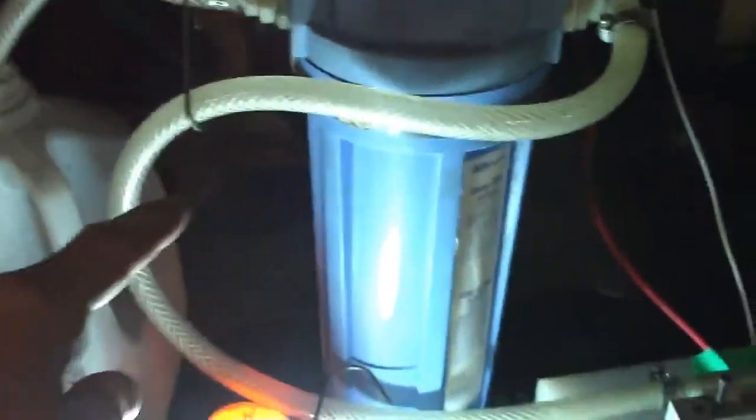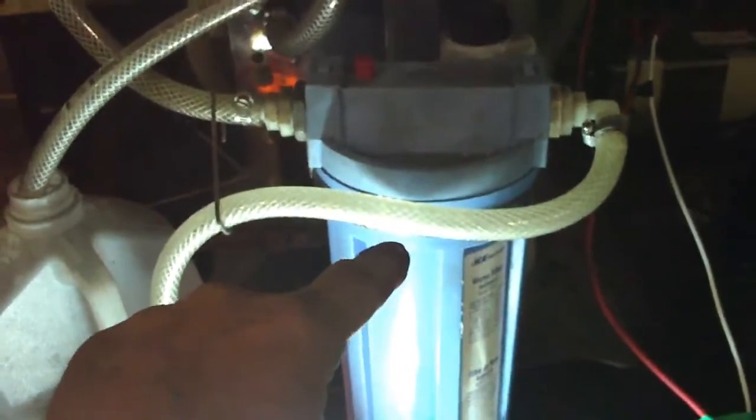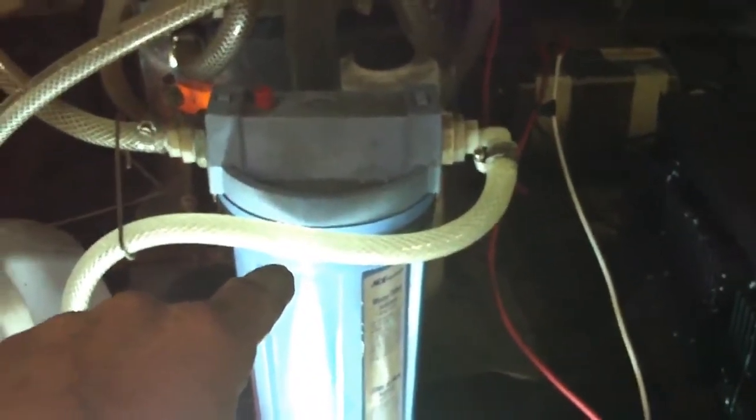This here, this light may be blinding you, is a spark gap. And what I do is I flow hydrogen gas from the cell. So in this case, this side here is the discharge line. It comes up through and bubbles through a stainless steel bubbler. The gas comes out, comes over, goes through a dryer where it separates the moisture out pretty well. Depends how many hours I have on it. In this case, a fair amount. It's not completely clean, but that's okay because it's going to help me determine this. In this case, I thought I had potassium hydroxide, but it turns out this spectrometer is indicating sodium hydroxide. So, got to get a hold of the vendor on that one.